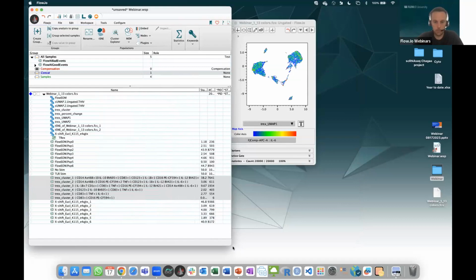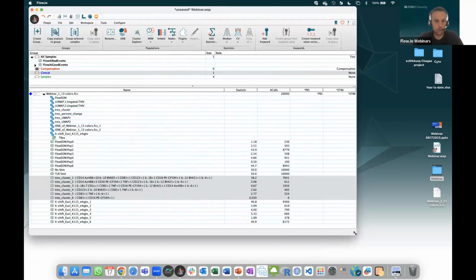It gave me a name. Okay. So if I look at the name, I can see CD14 positive with a vector of 10, so really CD14 positive, so that's probably my monocyte, IL10 positive vector of 1, CD83 positive vector of 1, etc. So I can see here that's my CD123 positive with a vector of 2, so that's probably my DC in cluster 4.